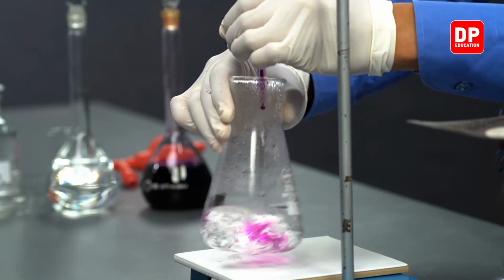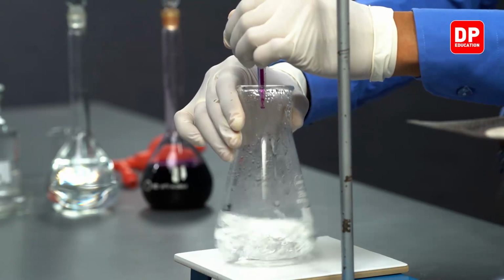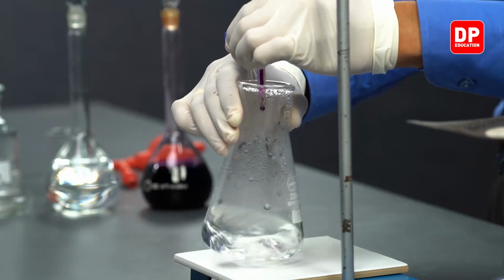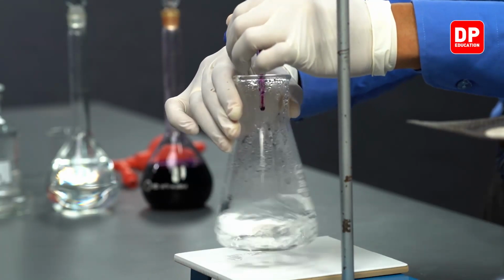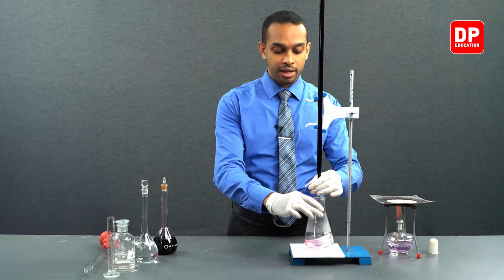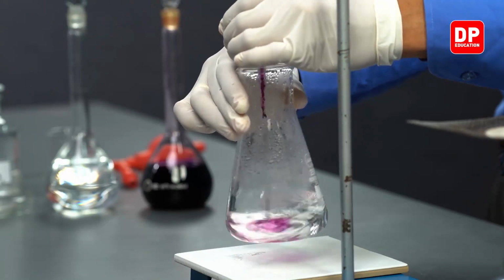As you can see, when we add potassium permanganate, the color of the potassium permanganate disappears completely. We need to do this titration while heating the solution constantly. So if the solution cools down significantly, we will again place it on our heating mantle over here, and we will heat it a little bit to make sure that we carry this titration out at a higher temperature than room temperature.